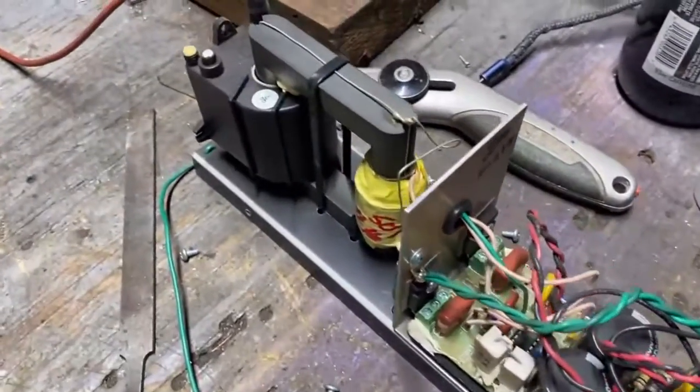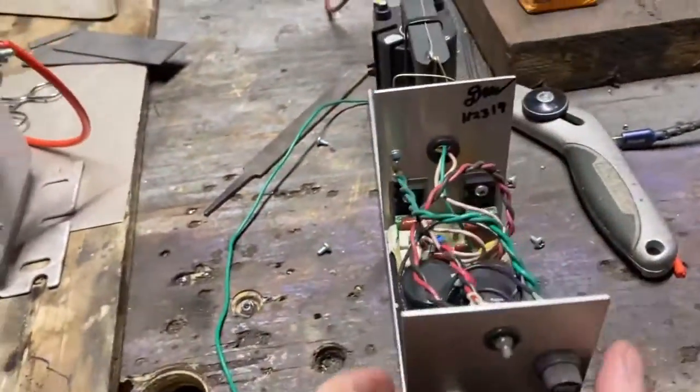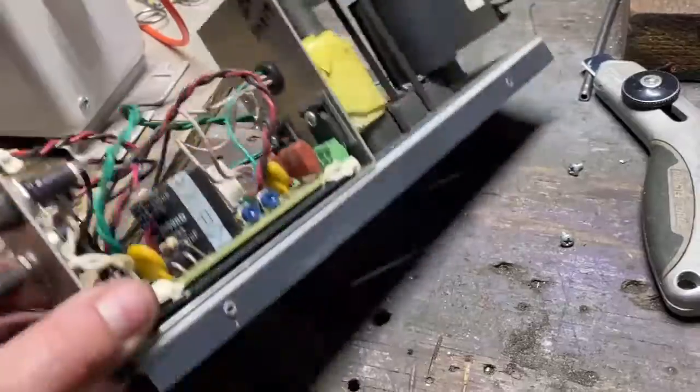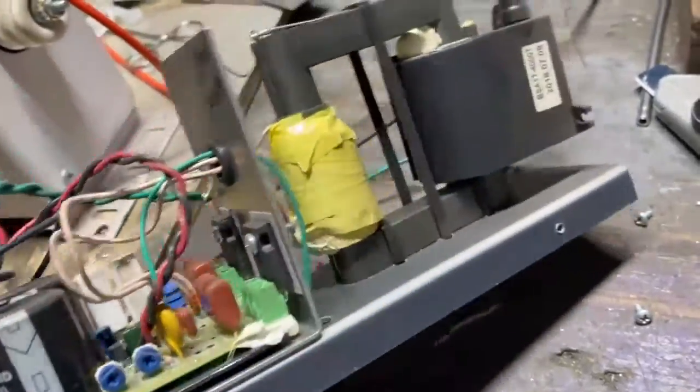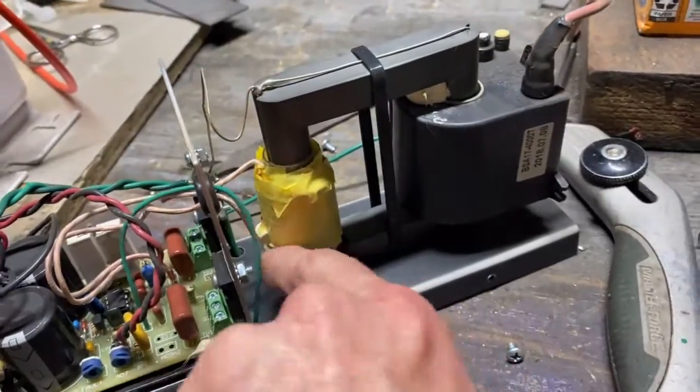We're going to give this transformer a test — it's a pretty cool little unit. I want to say it's 15,000 volts.